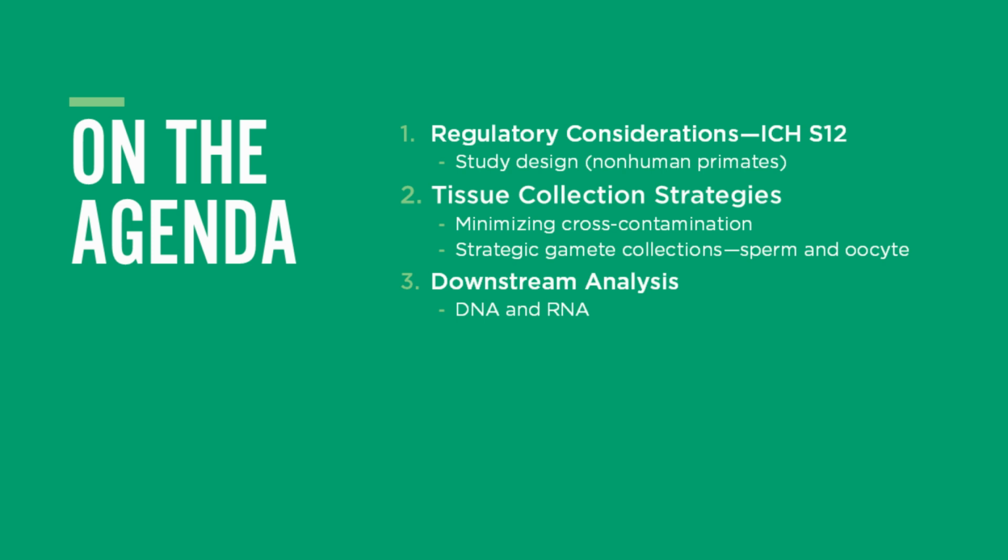On today's agenda, we will briefly review key study design items from a regulatory perspective, outline the specialized tissue collection strategies employed at our facility, and describe the downstream sample processing and analytical workflows used to isolate DNA and RNA for subsequent analysis.